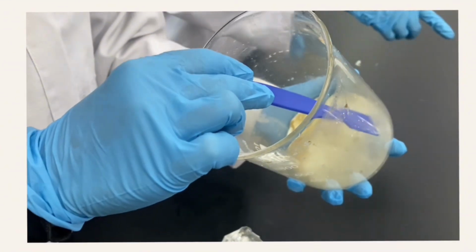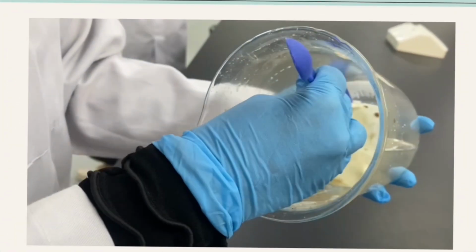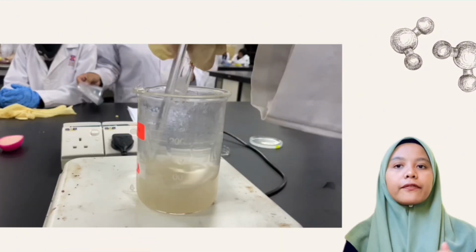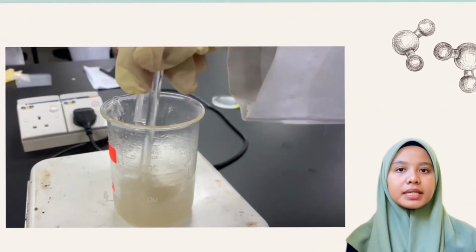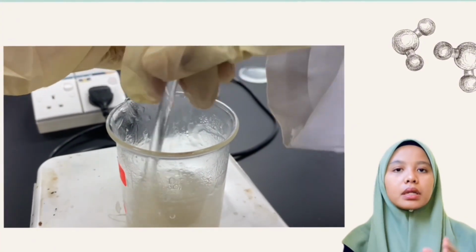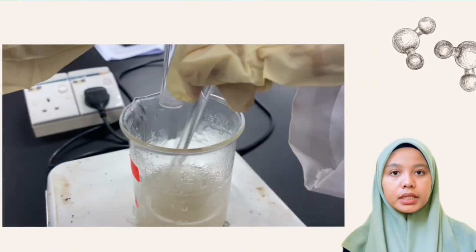As I mentioned in the previous result, our final product turned out cloudy because there was an error during the filtration of the potato starch, where we inadvertently failed to remove all the fiber. That's why the result has a slightly brownish tint mixed with the starch. Next, during the process of making bioplastic, we used glycerol as one of our most important ingredients. So, what is the function of glycerol here? Glycerol is a plasticizer, which means it enhances the flexibility and moldability of the bioplastic material. It also helps to reduce the brittleness of bioplastic and improve its overall mechanical properties.